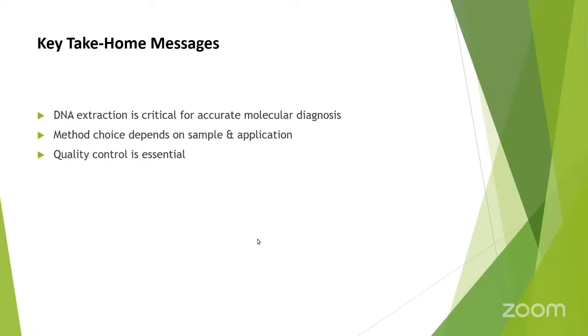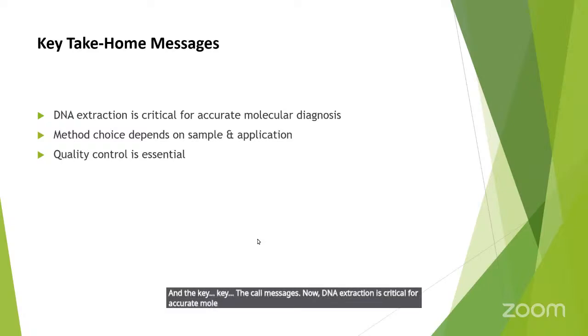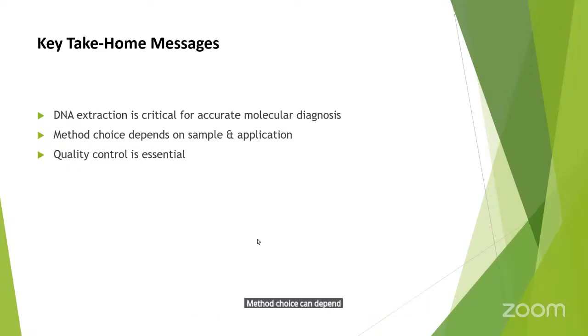The key take home messages now. DNA extraction is critical for accurate molecular diagnosis. Method choice can depend on sample and applications. Quality control is always essential.